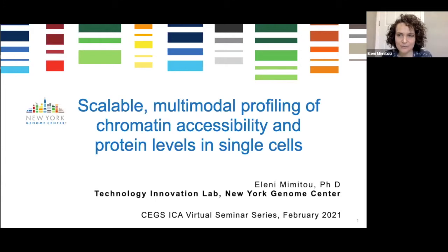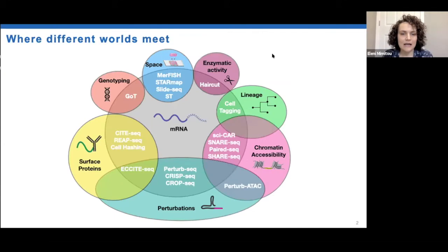I'm very excited to launch this seminar series by presenting our preprint on scalable multimodal profiling of chromatin accessibility and protein levels in single cells. As we all keep witnessing, and just what Rahul just said, combining modalities in single cell assays is increasing in popularity and utility. While mRNA is usually the common currency, several methods have been developed to simultaneously profile gene expression with chromatin accessibility, perturbations, spatial information, just to name a few.